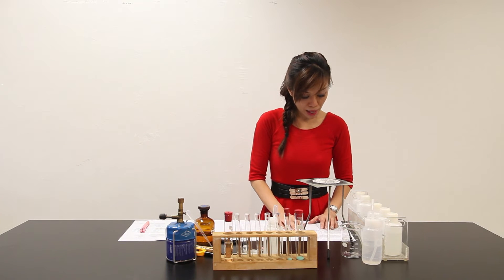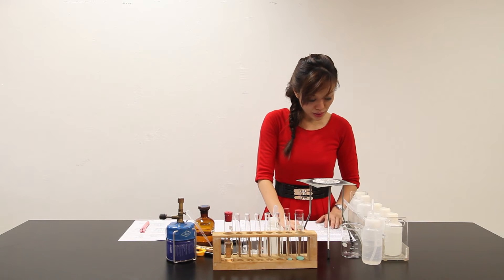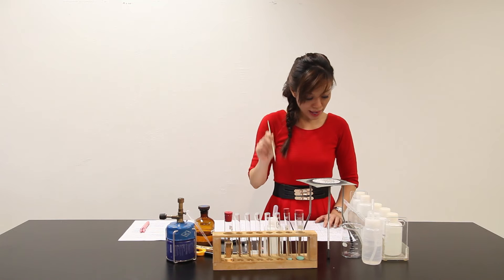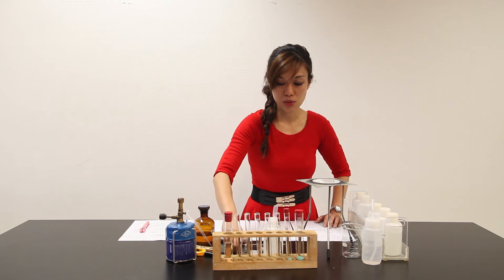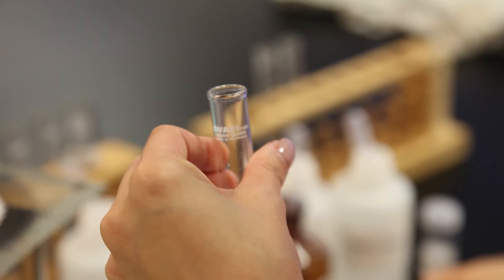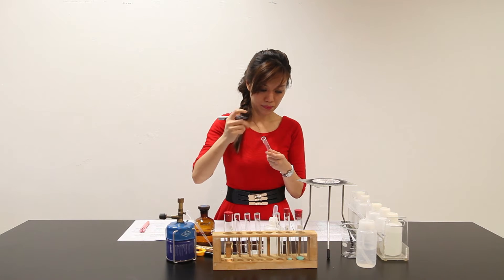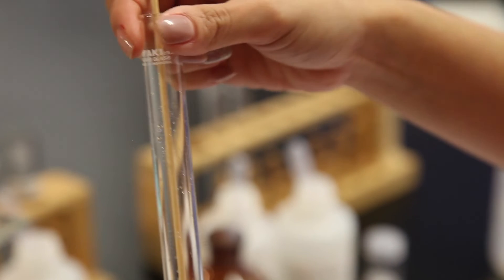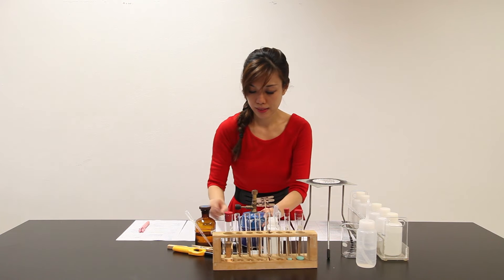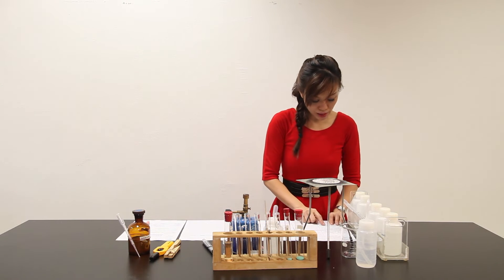Allow the boiling tube from Part A to cool for use in Part C. Perform Part B while you are waiting. Soak the end of a wooden splint — this is the wooden splint here — with water and dip the wet end of the splint into the second sample of SORT X. In order to dip it in water, let me fill one empty test tube with some distilled water and put my splint inside. Adjust the Bunsen burner to give a blue flame, and place the wet end of the splint in the flame.